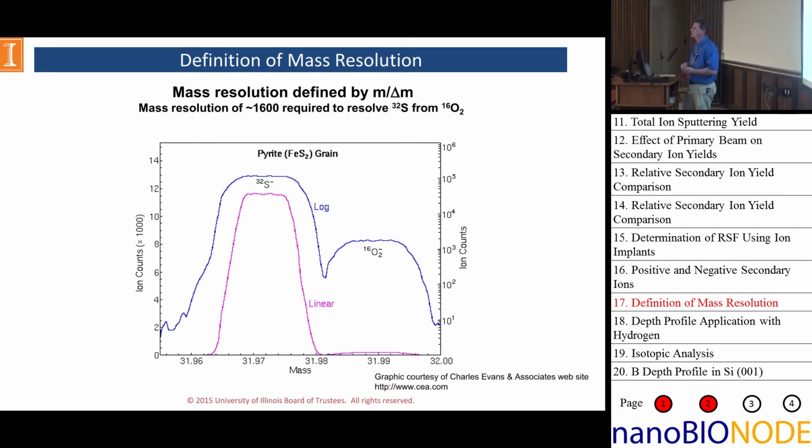That's pretty high. The main difficulty that we have is looking for phosphorus, because silicon plus one hydrogen can be very close to phosphorus. But those are the most difficult ones. Otherwise, the instruments we have have the ability to resolve the peaks. We can get that high of mass resolution if we're willing to throw away some signal.